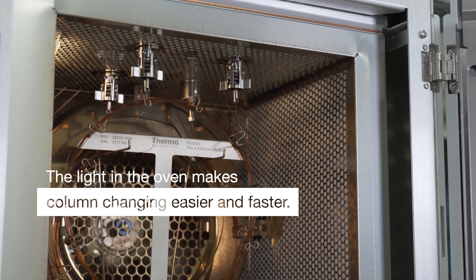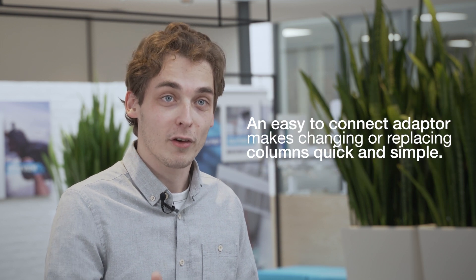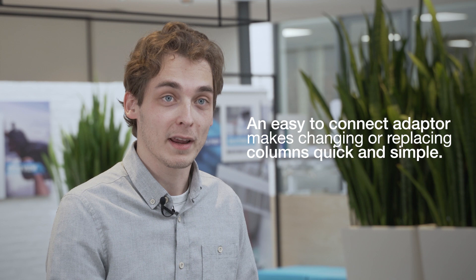That you see what you're doing inside that oven — and I think this light makes it very easy to see what you're doing and it makes switching columns a lot faster and easier. Talking about switching columns, another thing they've made a lot easier is how you connect them. They've now introduced the Easy Connect, which makes it so much easier to switch or replace your columns.